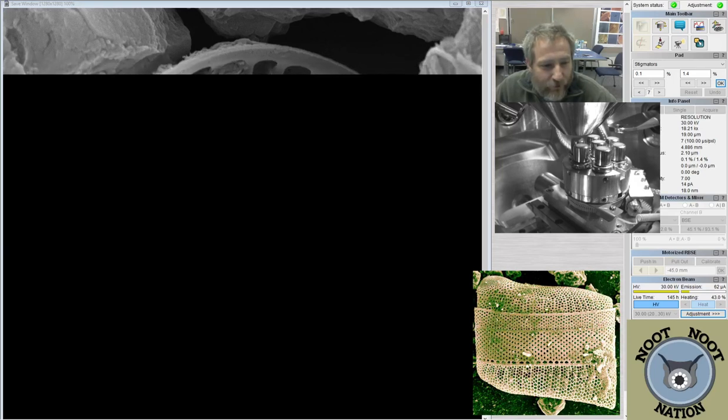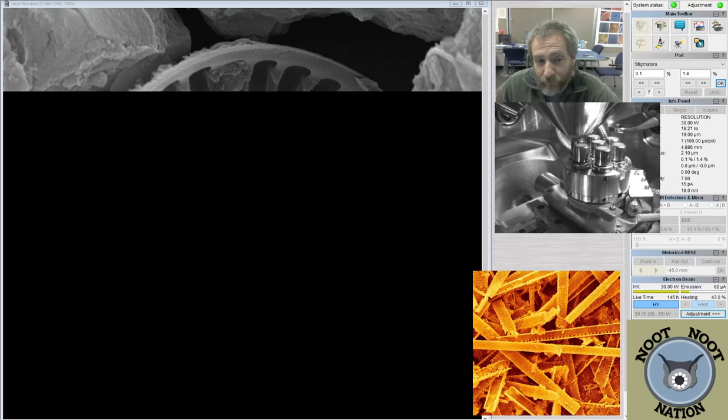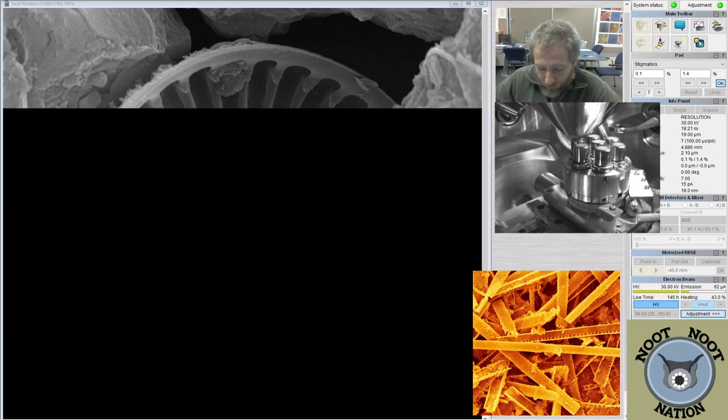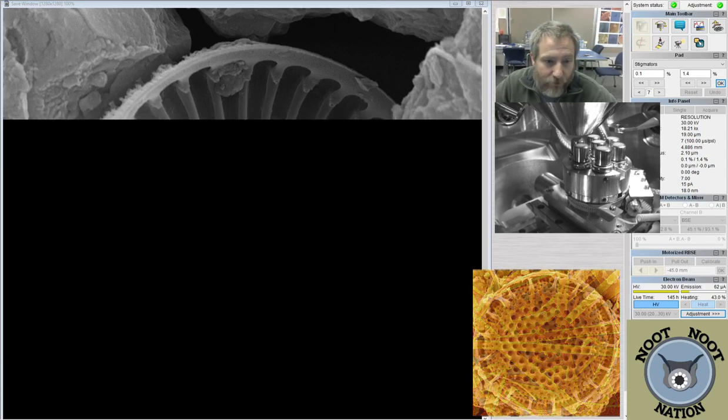Is there information we can glean from counting the number of spines? Probably not, unless you're looking for taxonomic information. For some diatoms, like Stephanodiscus, for example, the ratio of spines to intercosti will allow us to figure out what species we're looking at.